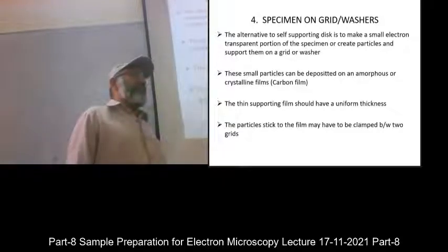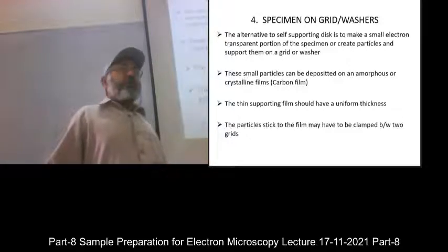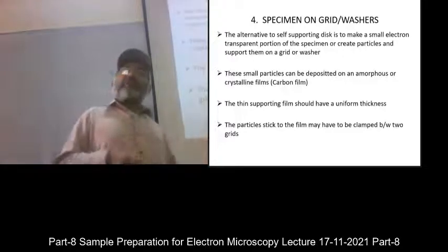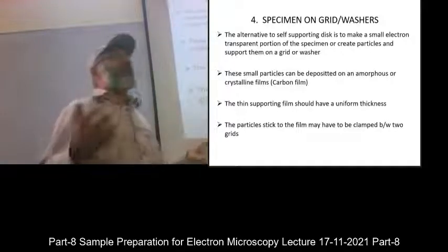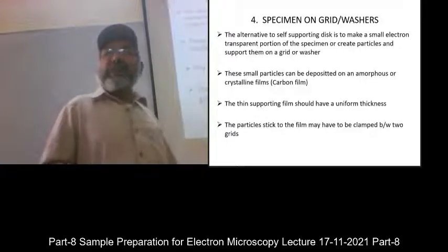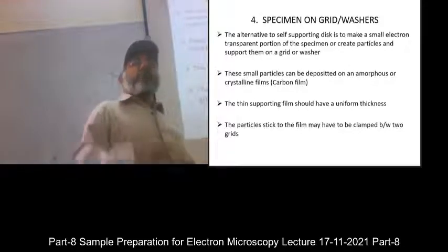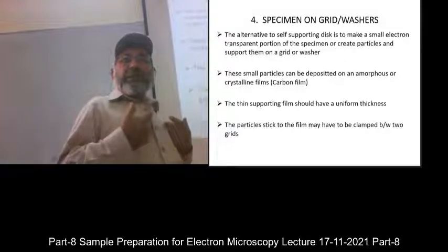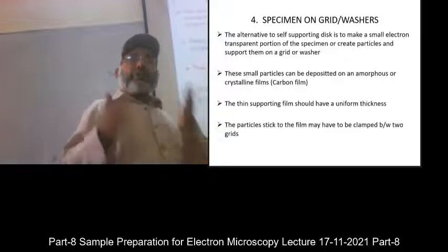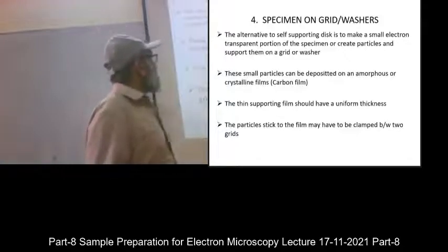If something can be done in a cheap and easy way, the best scientist is the one who adopts that easy way. But if something is not possible without TEM, then TEM is a very, very versatile technique, and never think that it has this limitation, that limitation. We have limitations: whether we have money, whether we have time, whether we have the smartness to devise that particular sort of sample and particular sort of environment.